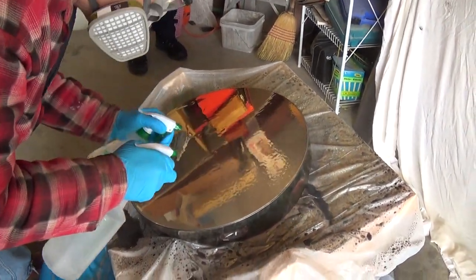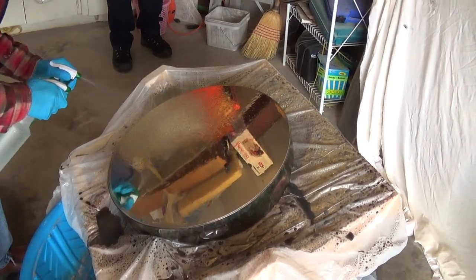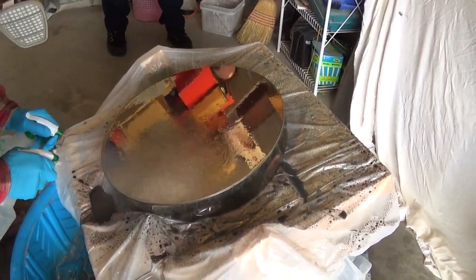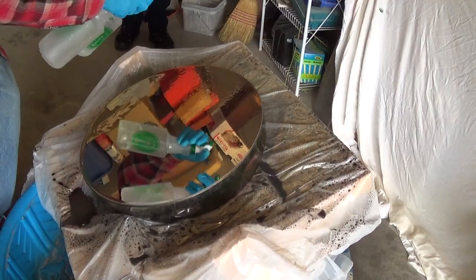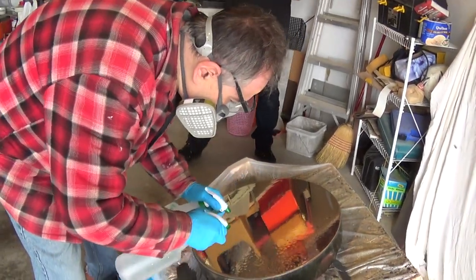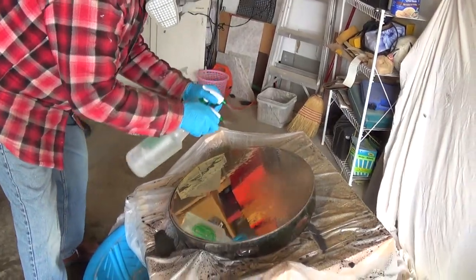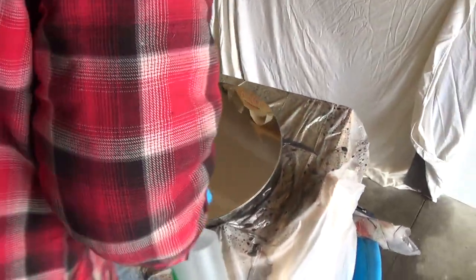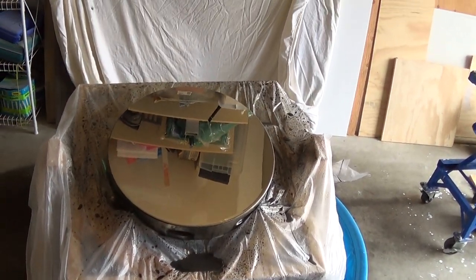My left hand is getting really tired. Sorry about that, guys. There we go. I'm going to make sure there's a good solid coating on that. It looks beautiful. Doesn't that look spectacular?